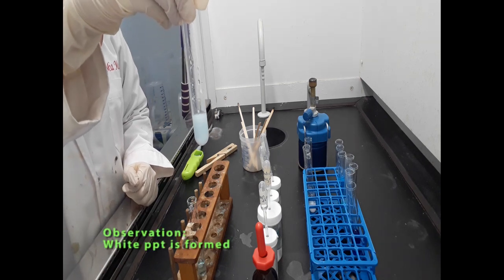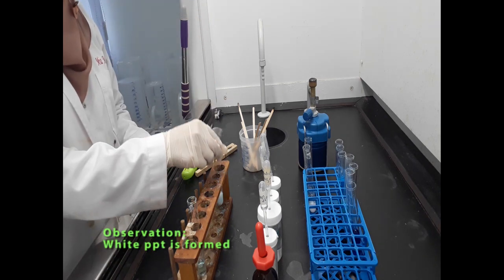White precipitate is seen. And again, by referring to the qualitative analysis notes, for solution S, there is no sulfate present because it gives no reaction when adding barium nitrate to the solution, but it gives white precipitate when aqueous silver nitrate is added to the solution.